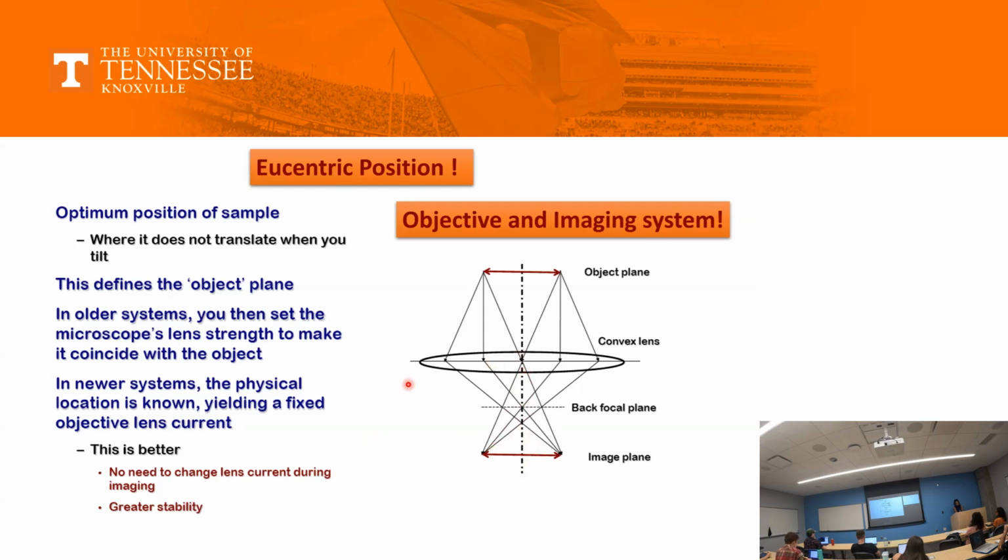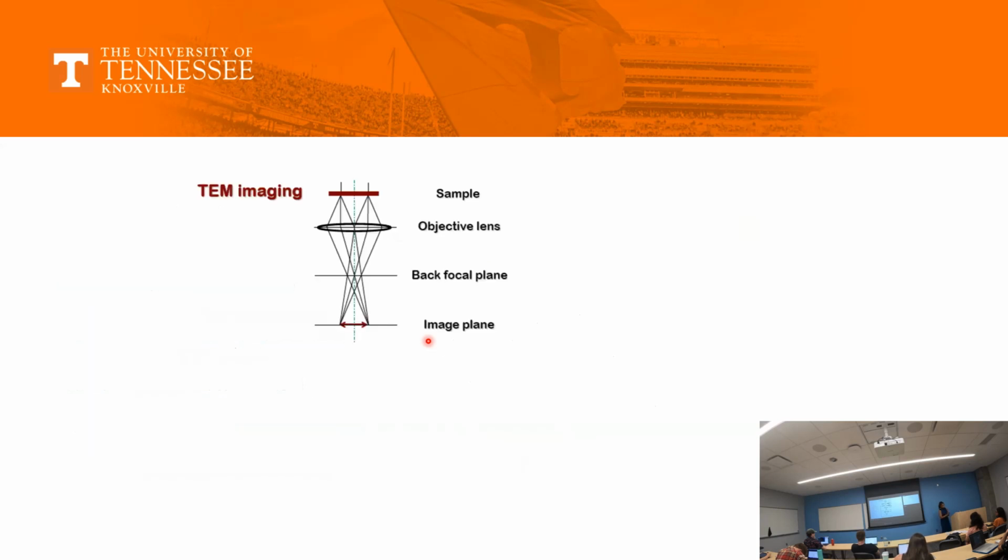Not constantly changing magnification to bring it in focus. It's a counterintuitive way. You would reach it, but you would destroy the entire alignment. If your image plane is at one particular distance, and you start playing with the position of the lens or with the magnification of the lens, you would reach somewhere, since both are totally interrelated, but that would be the wrong way to do it.